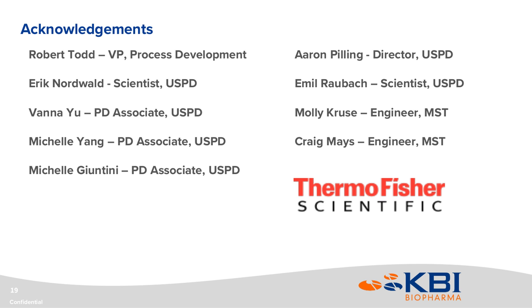And I think from the clinical material demands associated with our SUF programs, it's an acceptable trade-off for the flexibility and throughput gain from the SUF. So even though we may see a little lower titers, a little lower cell densities, I think the flexibility that we achieve for both the client and our facility is certainly worth that.